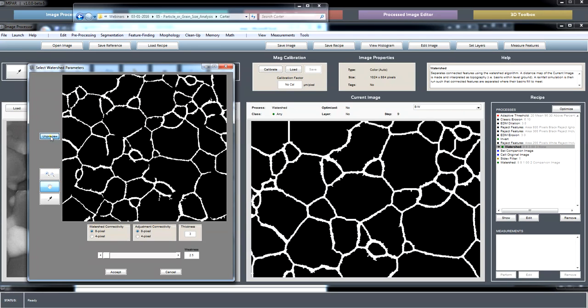So we start with this and we end up with this. And this weakness value setting is usually never going to be any higher than 50. At very high values, it can start to do some really funky things. For separating binary features that are touching each other, I'm almost always at 5 or less.